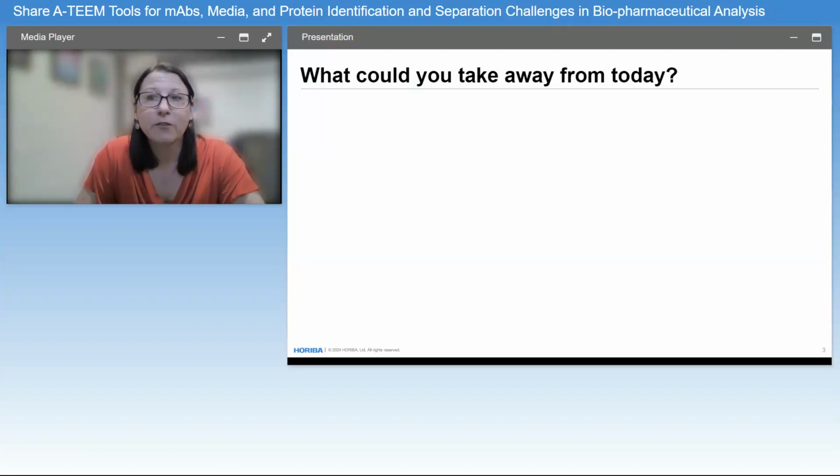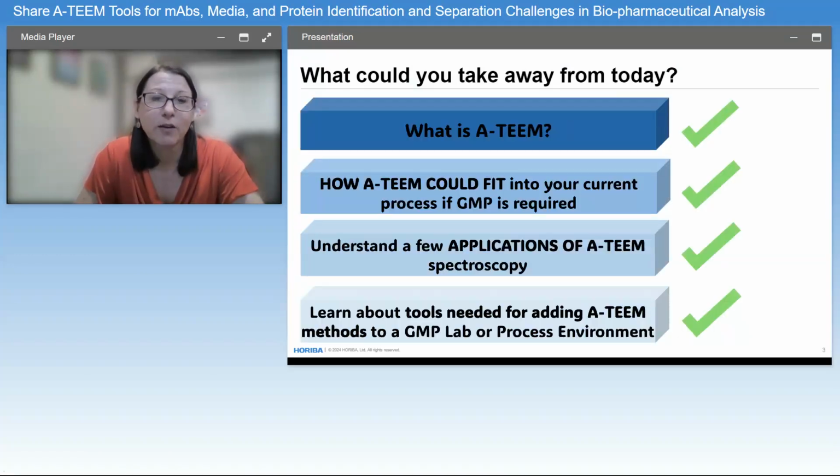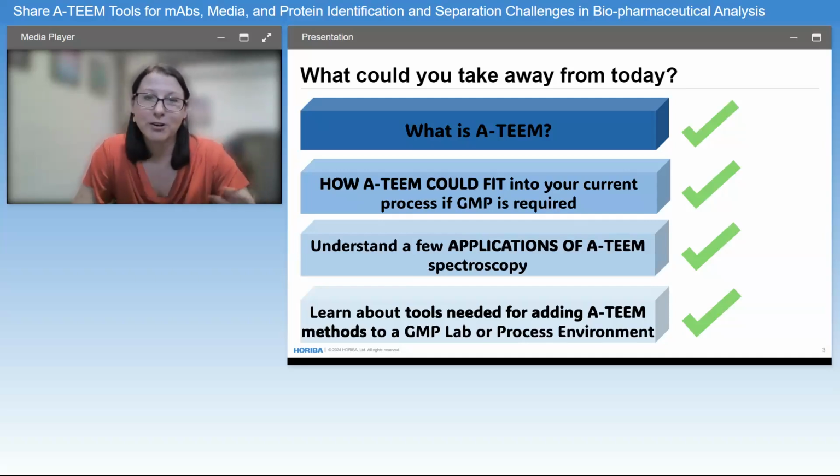I also want to point out first what to look for from this webinar. So what you can take away from this webinar today. First, I hope you can all better understand some of the basics of A-TEEM. If you're already familiar, a refresher never hurts. And how A-TEEM can fit into your current process if GMP is required.